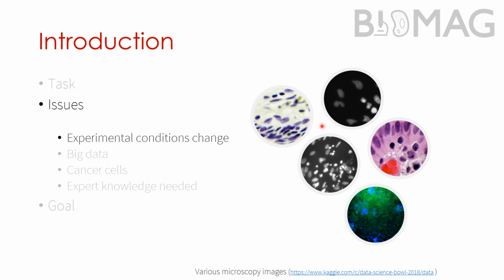And even if we repeat the same experiment with the very same conditions, the imaging part or sample preparation might cause differences, or simply the cells themselves sometimes tend to rapidly overgrow compared to other experiments. So we need software solutions that can cope with these differences.